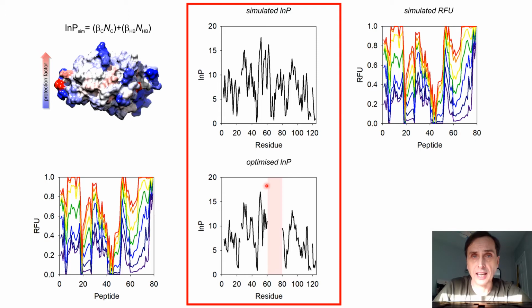There's some missing data here. This is just because it's an experimental peptide map, and we didn't have full coverage.